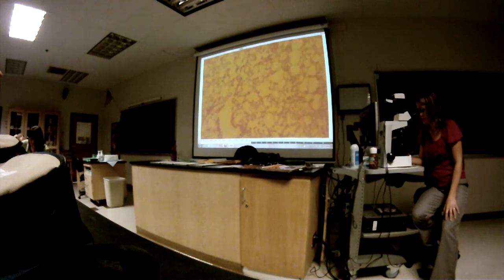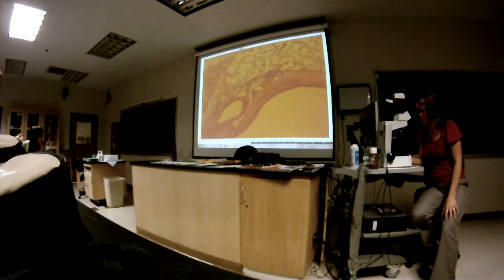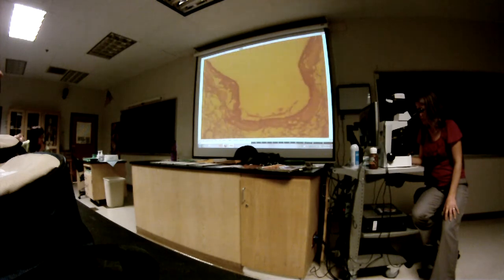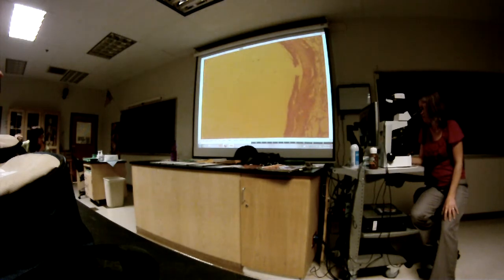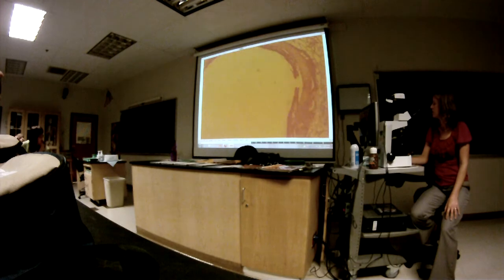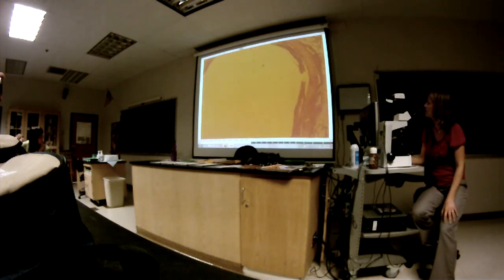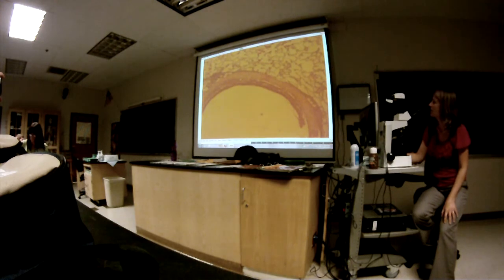Wow, that's a funky one, huh? Boy. It's all stretched out. Okay, well, we'll take it for the sake of time. This one's kind of stretched out, a little funny down there. But you can see the hyaline cartilage right there.